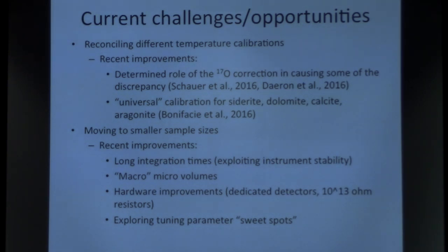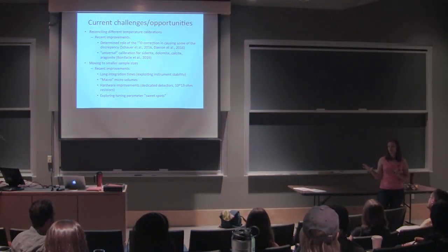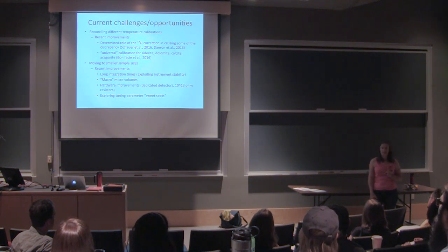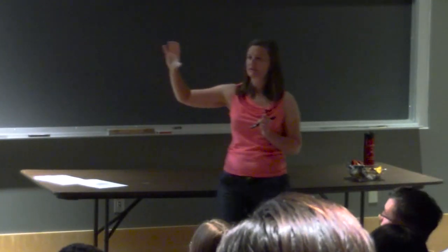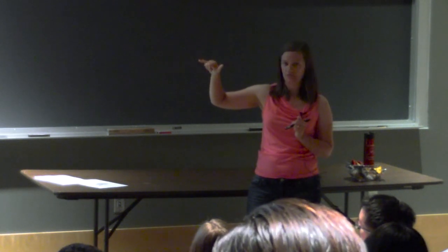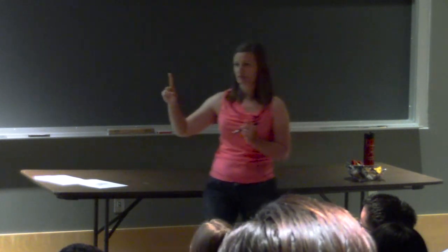When I was at Caltech, we needed about 10 milligrams, 8 to 10 milligrams of 100% carbonate for a single analysis. And we would run that gas over and over and over in repetition for about 3 hours, right? So the analytical improvements on the instrumentation have made it so our individual measurement is pretty strong. So your reference for this is a single acquisition that we might run to get a C13 and O18 value from that foraminifera. We would run 8 of those repeat acquisitions for a single clumped isotope value. So you know your C13 and O18 really well at the end of it.